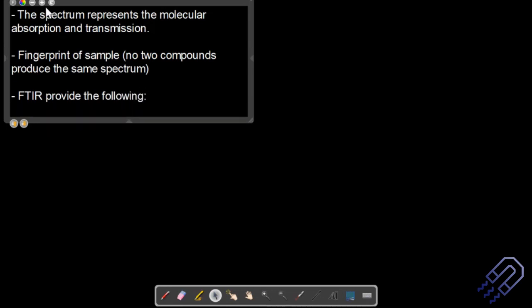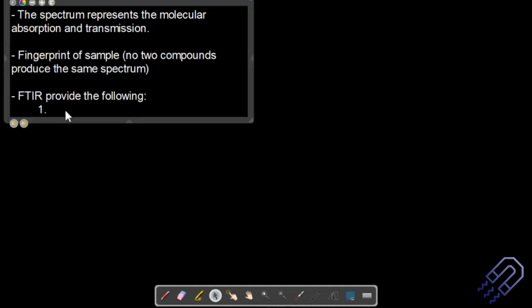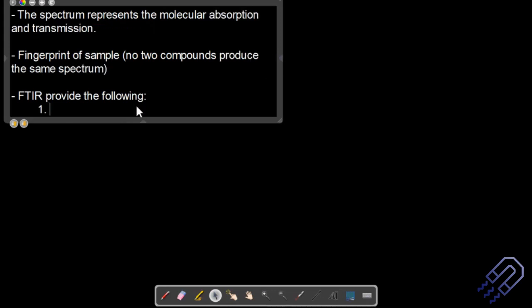So if you do XRD, you know what kind of material it is. It also has some peak positions, which can be called more or less a fingerprint. But in FTIR, you are really not sure. In XRD, you are more concerned about the crystallinity and other parameters. Here, the crystallinity is secondary. The important thing is what functional groups are present. It's a very important tool in chemistry.